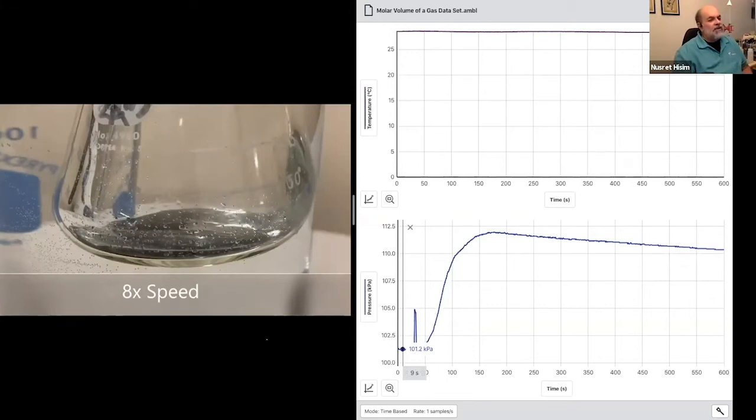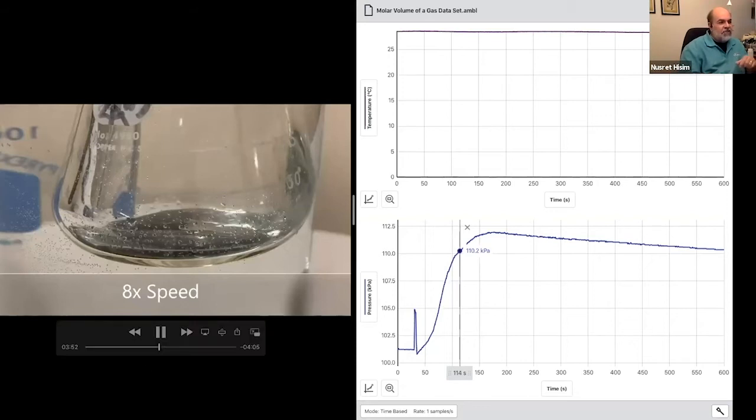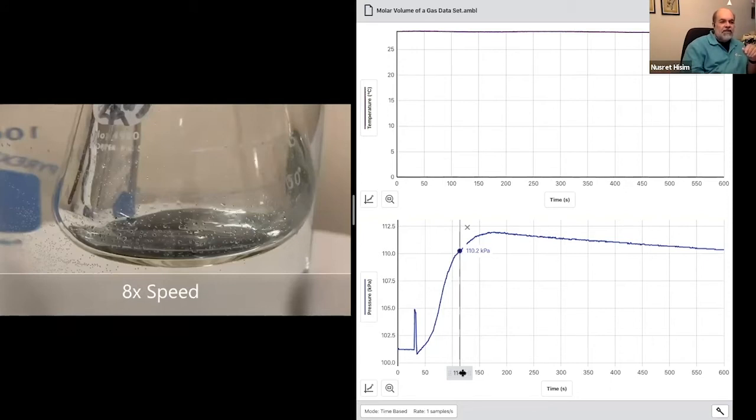One side note: Jack Randall, who wrote the lab manual, and I have talked about this — there is a way to do this without a syringe. If you're curious about how to eliminate this pressure bump and do this without a syringe, send me an email at chemistry@vernier.com. I don't want to go into it now because this is the procedure in the handout, but it is possible. What's happening now is the magnesium is reacting with the HCl, so pressure is increasing as the hydrogen gas goes into the flask.